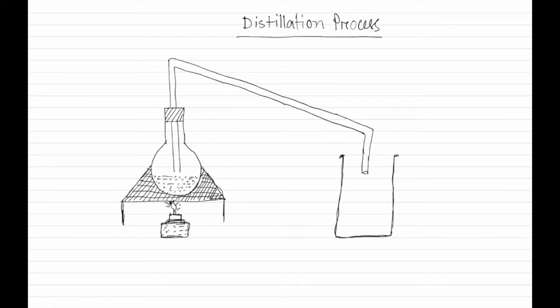Now, if you start heating this process, then the water or the solution starts boiling, and boiling water or water vapor starts moving towards the other outlet part of the tube or delivery tube.